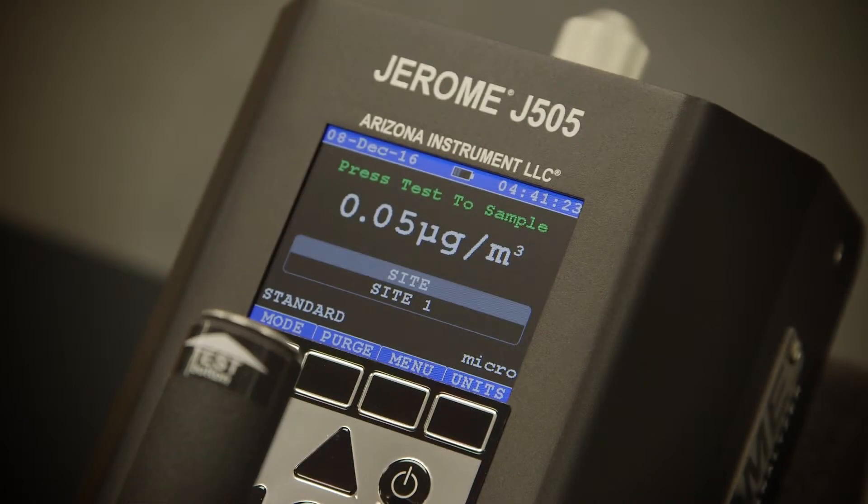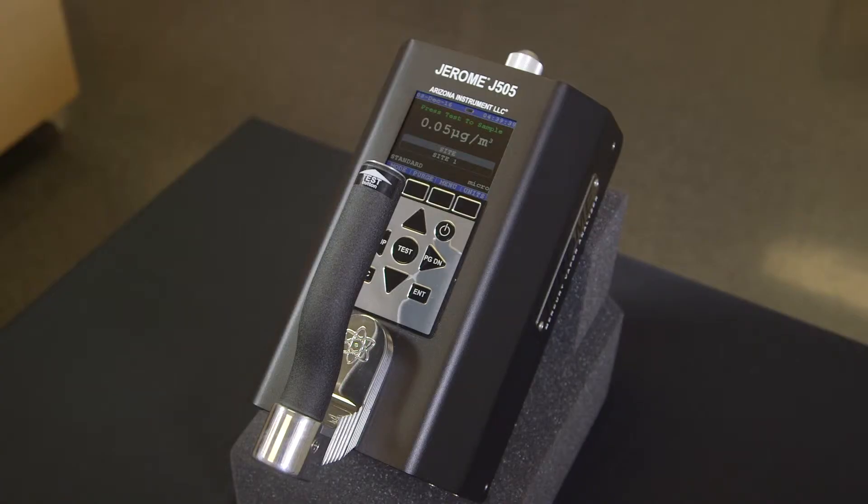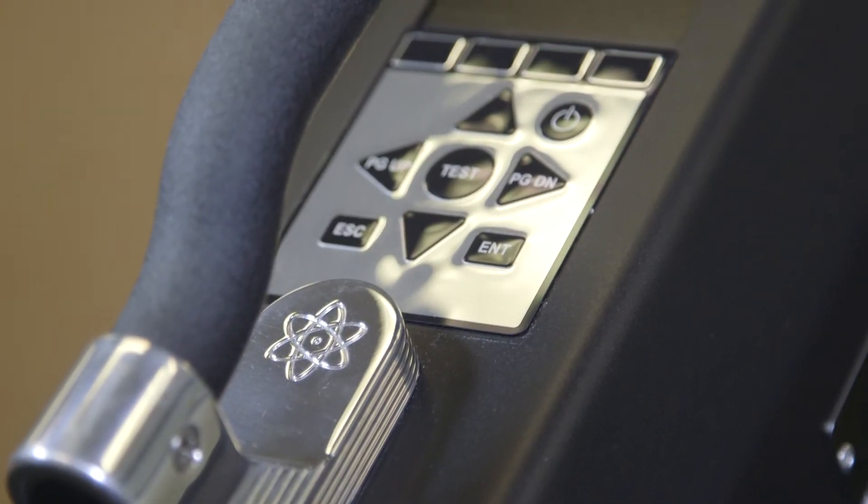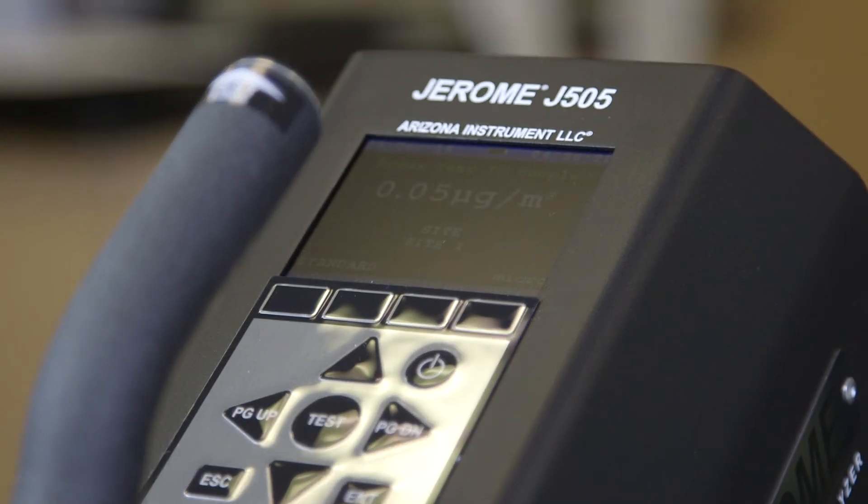With three modes of operation and three units of detection, the J505 is good for use in almost any mercury detection situation. The J505 even features a programmable auto sampling mode and has a choice of two independently programmable high limit alarms.